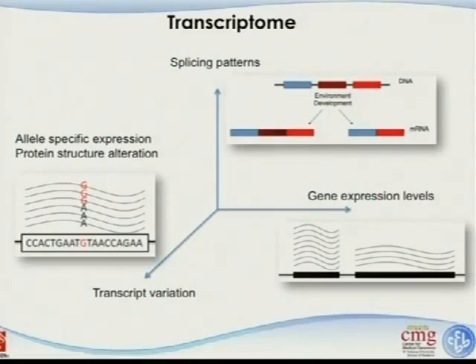But clearly RNA sequencing can do this to a certain extent better, because you intrinsically look for not only the expression levels of different genes, but also the sequences. You already get it. As one example, just to show the idea: the reference genome at this location is a G, but in your final product you see half G, half A, and you will know there's a heterozygous variation in that region. Those are things that an array cannot do, but RNA sequencing can do.